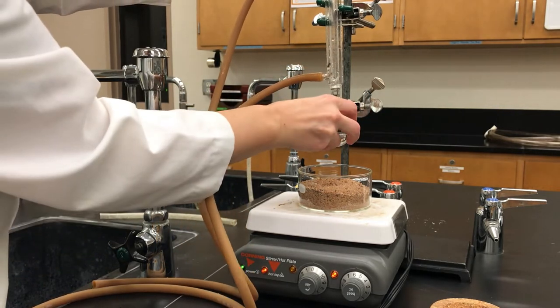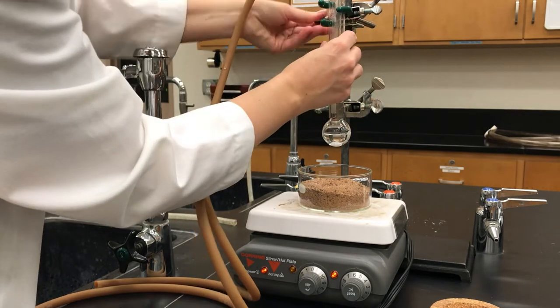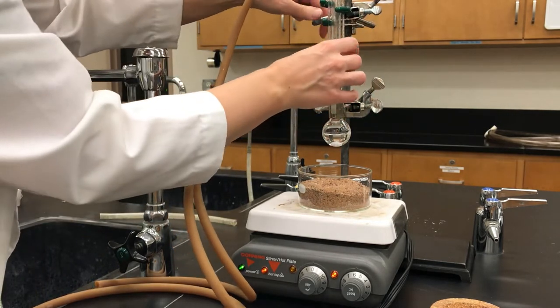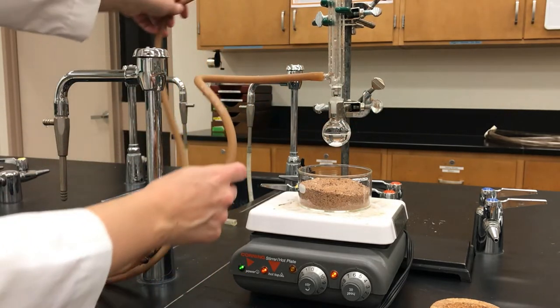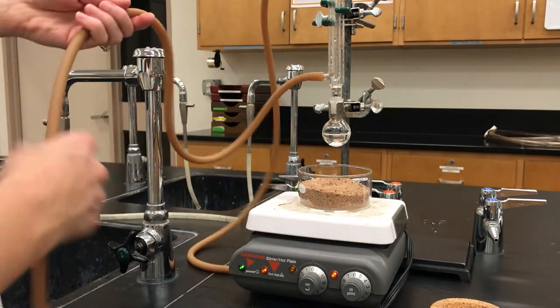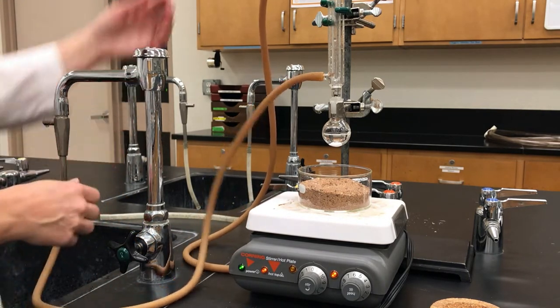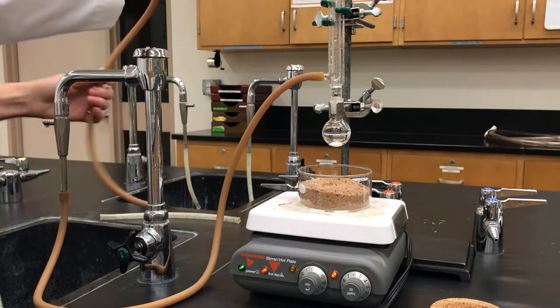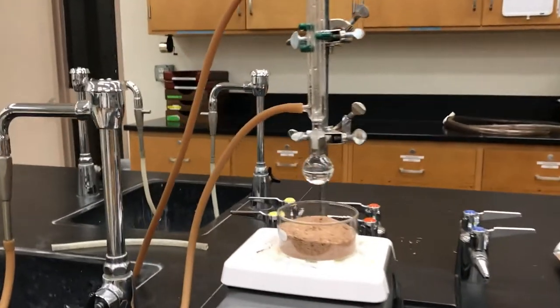And if it's a very tall condenser, you probably want to use a second clamp to secure the whole thing. If you're using a very short condenser, like from a micro kit, you might not need to use a second clamp. Then the bottom hose is going to connect to the faucet because we want water to go up against gravity, and then the top hose is going to drain into the sink. So this is what it looks like.